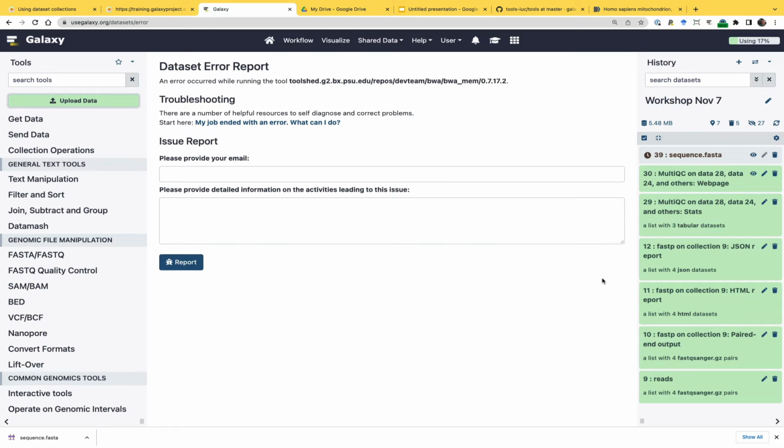Sometimes you delete datasets but then realize you didn't want to. They disappear, but they're still there, so you can always get them back if you want. This also tells you how much this history occupies, and how much of your total allocation you are using.